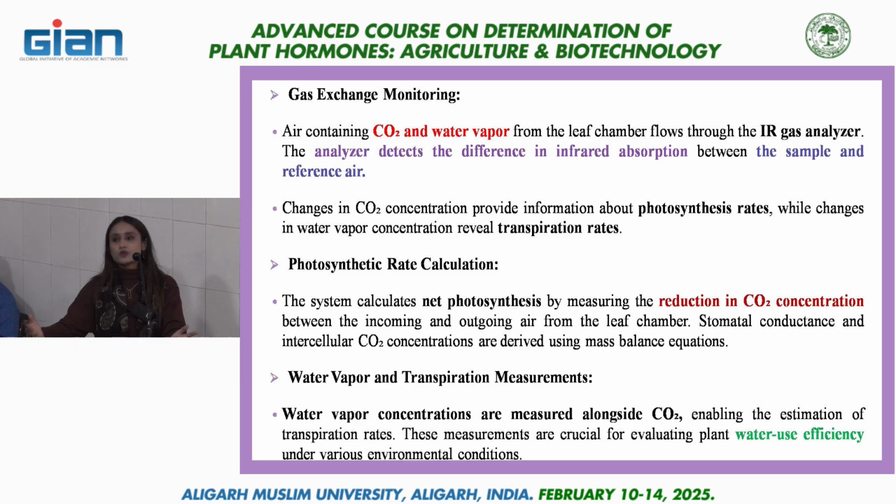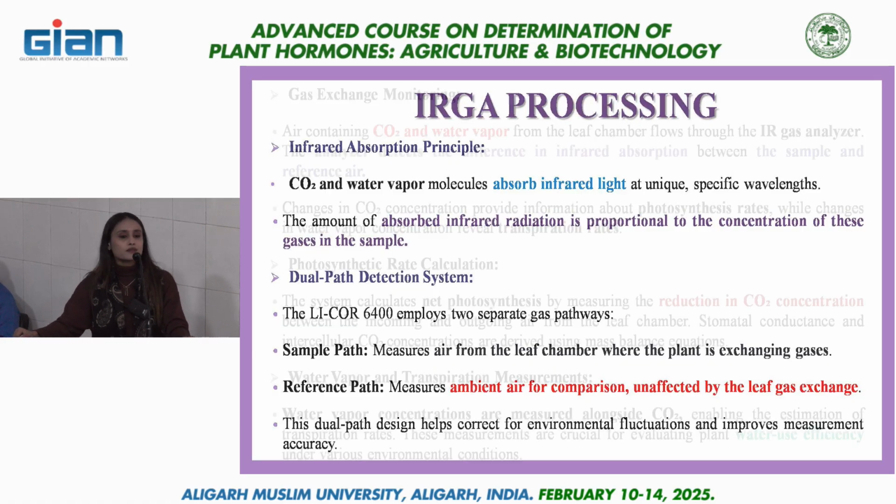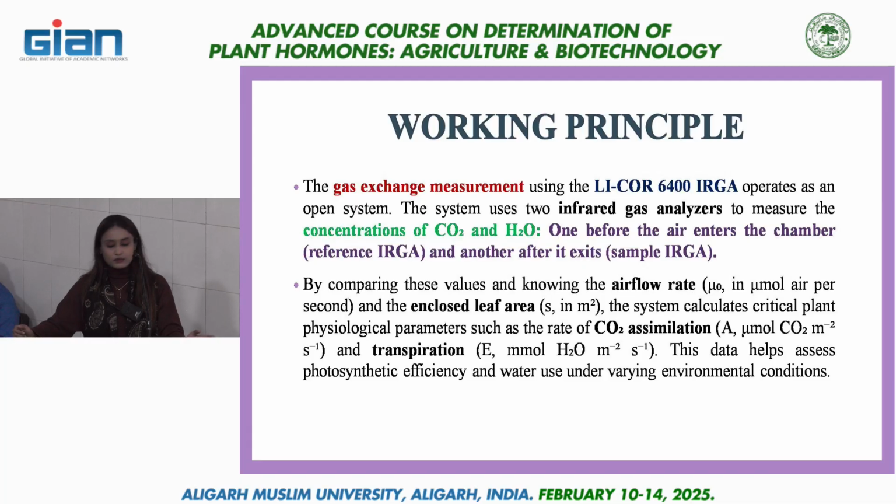So this is the most important instrument, and luckily our lab has it, and it has helped a lot in our research. So what is the working principle of this IRGA? The gas exchange measurement using this LI-COR 6400 IRGA operates as an open system. It is basically an open system.